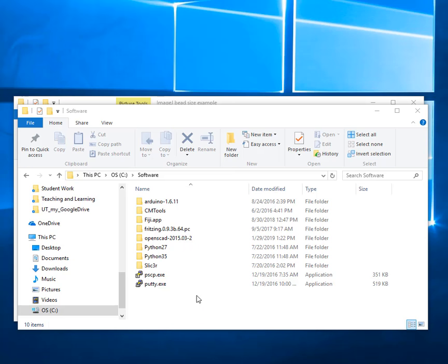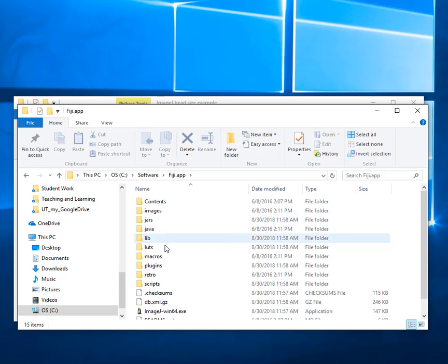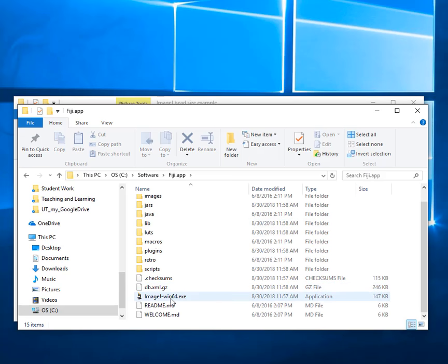So the first thing I'm going to show you is that when you download Fiji, it actually doesn't have a Windows installer. It's just a zip file so you can just unzip it and it will put it in this Fiji.app folder, and then to run ImageJ you just go in there and run the executable in Windows, and it's the same thing in Mac I think.